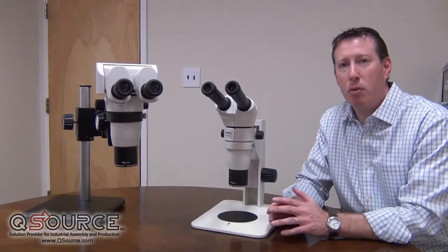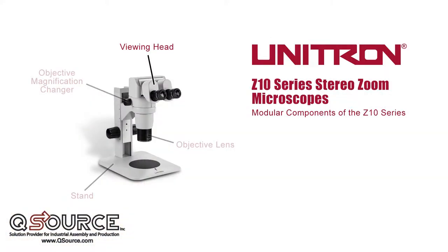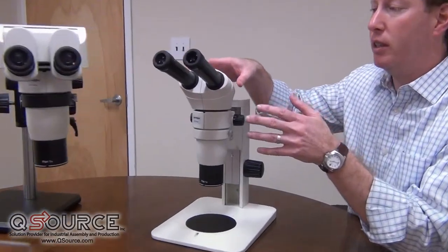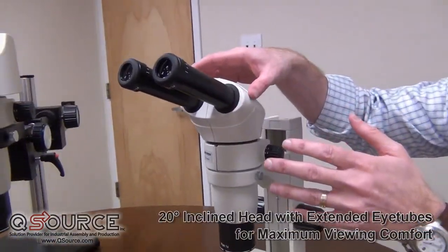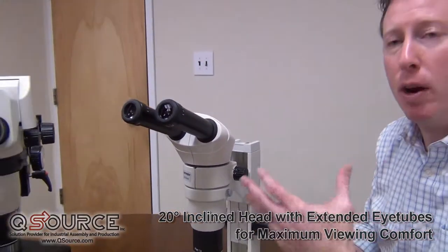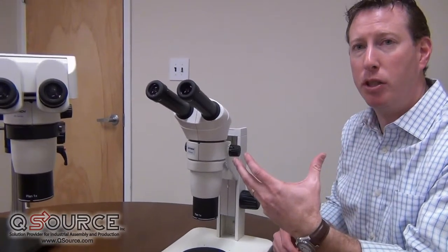The Z10 stereo microscope is a modular system consisting of a viewing head, which you see here. The first option is a viewing head with a 20-degree viewing angle and straight eye tubes that come out. This allows the user to be back away from the specimen, but yet in a very comfortable viewing position.